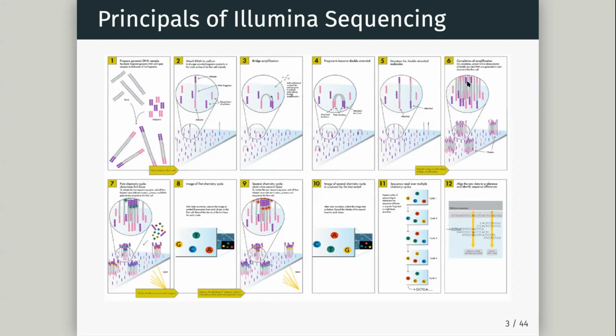So then it actually comes to sequencing this. What we do is we add in cycles different bases. So we will add, say, there are 4 different bases, and each one of these will be colored. So they have a fluorescence to them. And I'm not sure if this is actually the colors, but say guanosine is yellow, C is blue, A is red, thymine is green. So every time we add these colors, we have a cycle, and one base gets added to our DNA fragment copy. So we're kind of making a copy of these clusters by adding one base at a time.